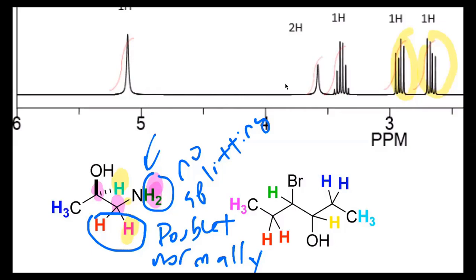When you were looking for the neighbors for the teal hydrogen, why were you able to count the CH3 ones and the NH2 ones? Oh, no, I didn't count the NH2. I'm only looking at the immediate neighbors. When you were talking about the teal hydrogen? Oh, the one here. Yes. So it's on this carbon, and this carbon is next door to this carbon, and it's next door to this carbon with the CH2. I'm only looking at the immediate neighboring atoms. Are you following?